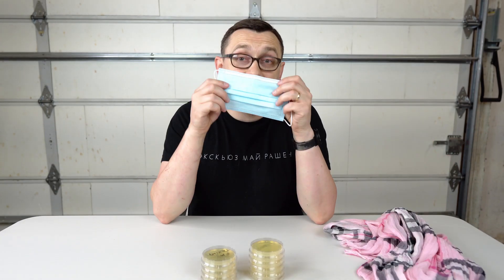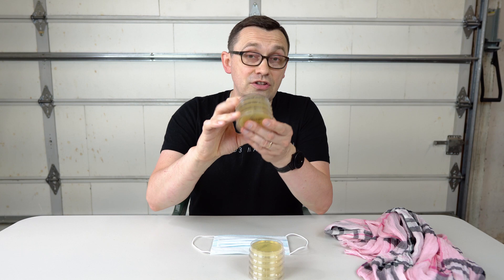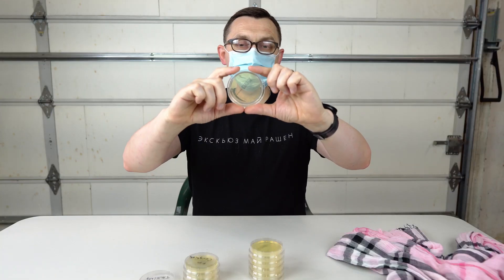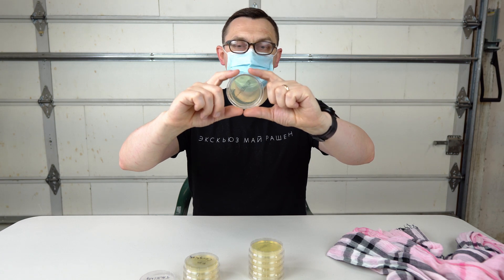So what I'm going to do is wear a face mask and try to talk, cough, and sneeze onto petri dishes while wearing the mask. Then I'm going to do the same thing wearing the scarf, and then the same thing without any mask or scarf. So I'm going to put the mask on and try to make it pretty tight, like we're supposed to wear it — tight from all the sides. I'll hold it like this and try to talk. I think one foot is enough distance.